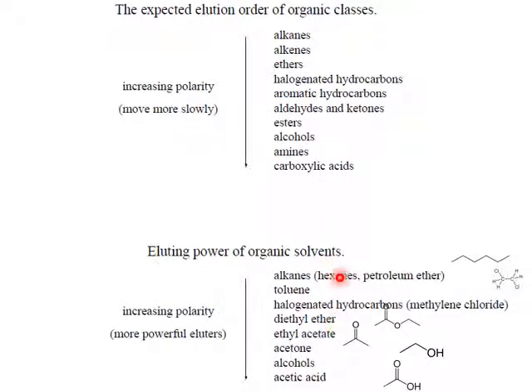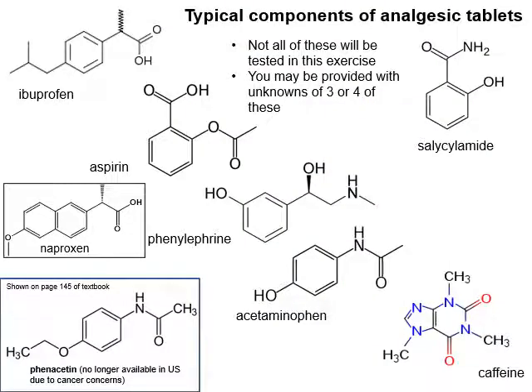That way, first I'll use a lot of hexanes and a little bit of diethyl ether to separate my compounds. And then as they're separating, I also prepare another sample, and those I use more diethyl ether to push them further up, right?